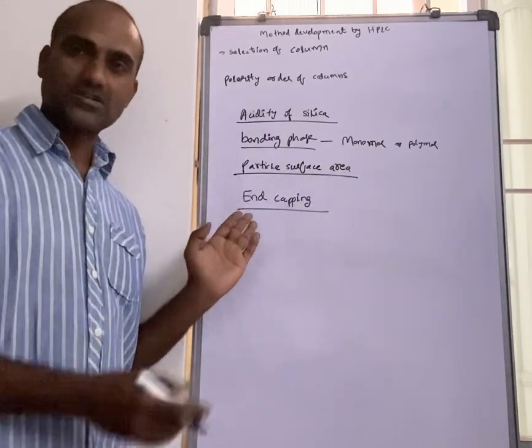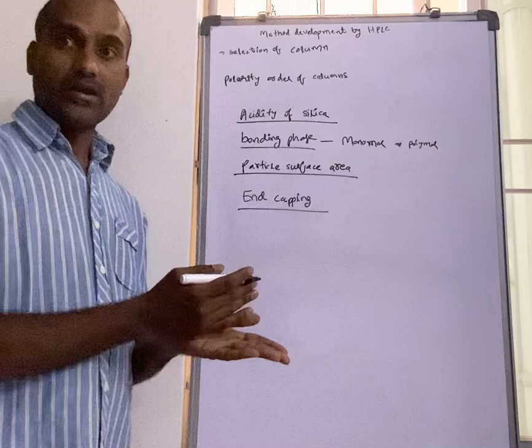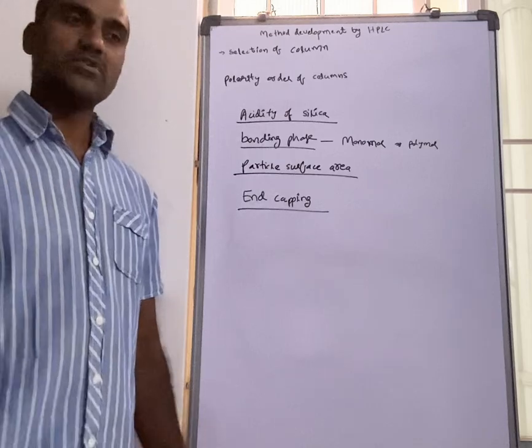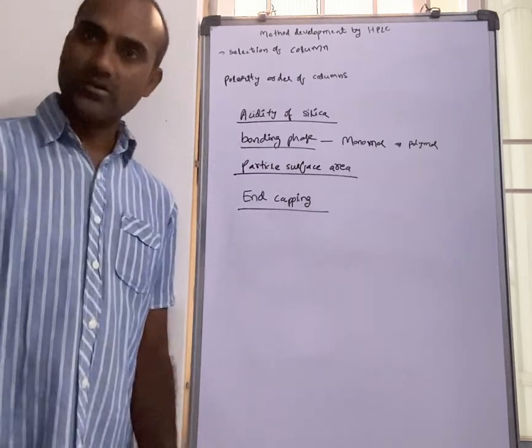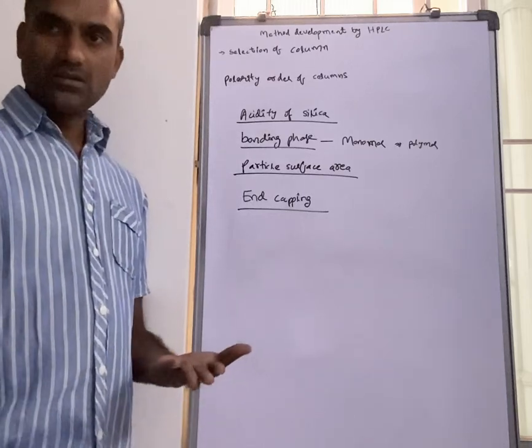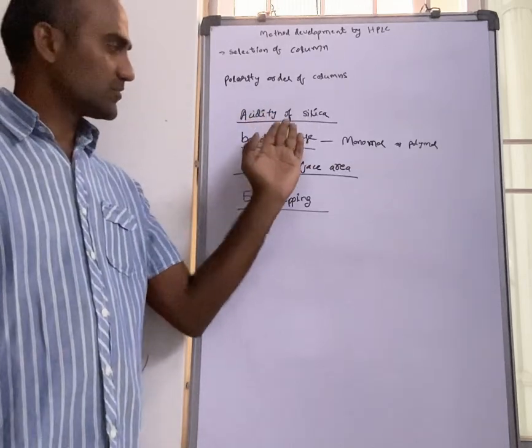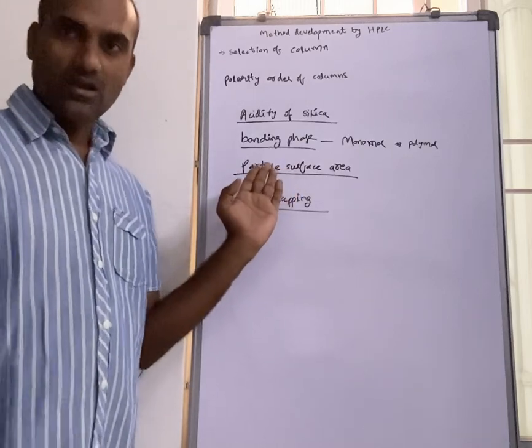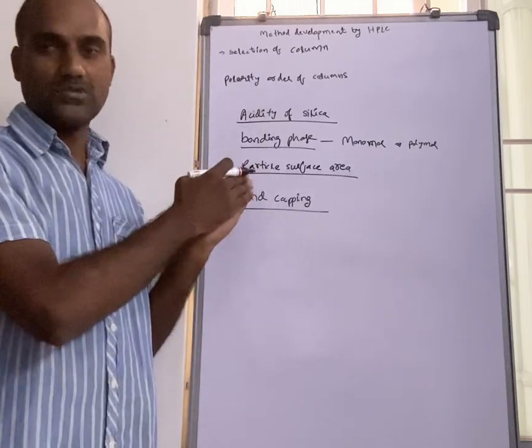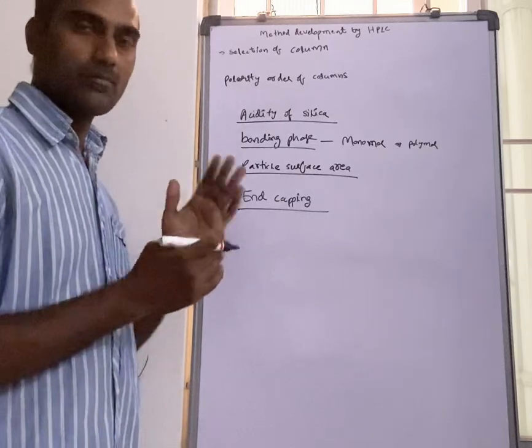So based on this, we may achieve separation in one column and in another column we may not. Even between old column and new column, sometimes while developing a method with the old column all impurities separated, and we procured a new column and there was a sudden surprise: peaks merge in the new column. Why? Because of these small changes, while manufacturing they may not get exactly the same as the old one. Not every time, but sometimes it may happen.